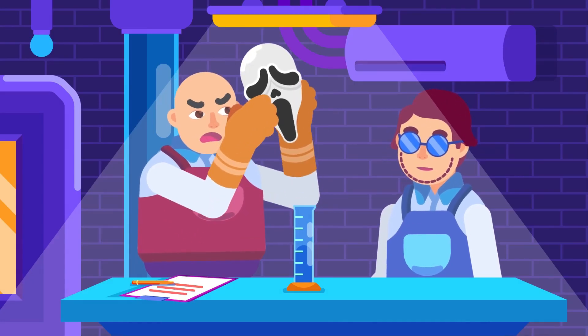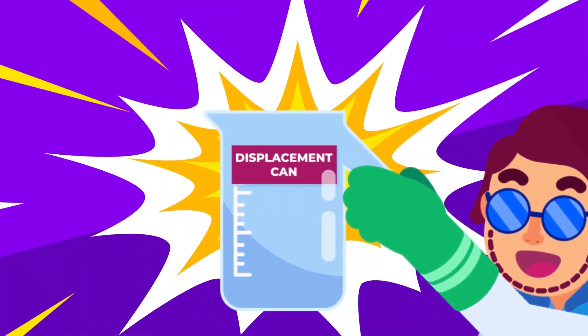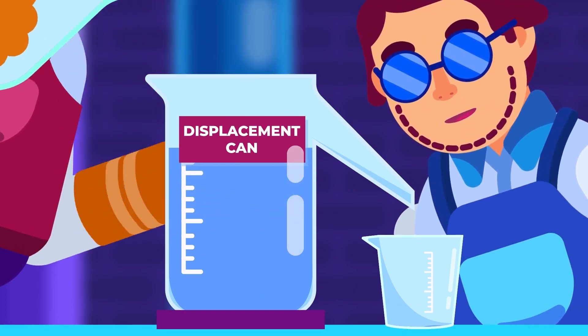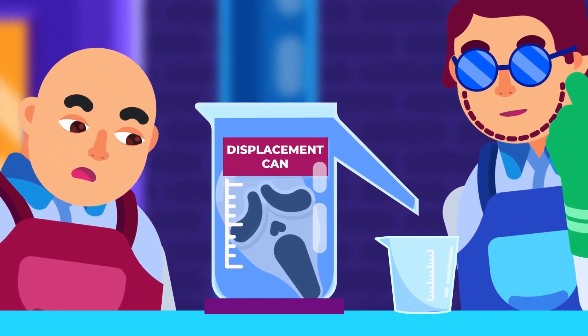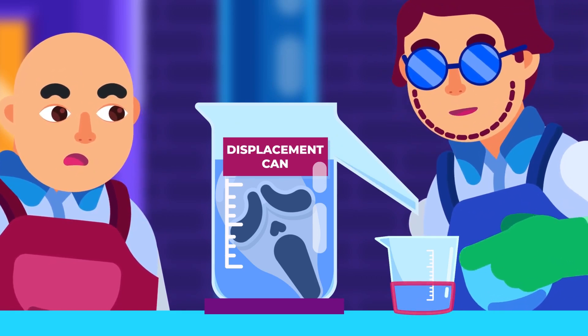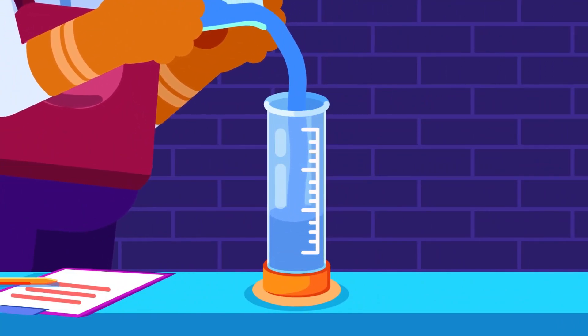To measure the volume of irregular solids larger than the measuring cylinder, use the displacement can. Fill the can to the spout with water and position a beaker glass beneath it. Immerse the solid into the water, causing it to overflow into the beaker. The volume of the overflowed water is equal to the volume of the solid. Then pour the water from the beaker into a measuring cylinder for accuracy.